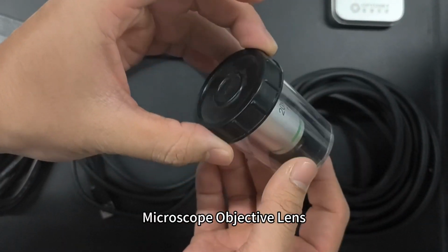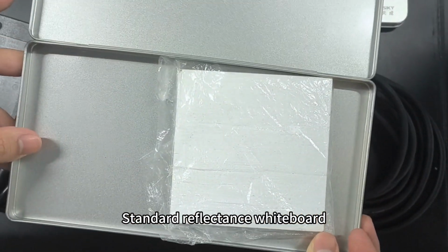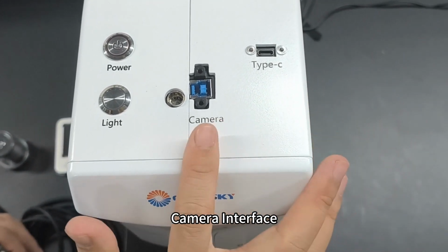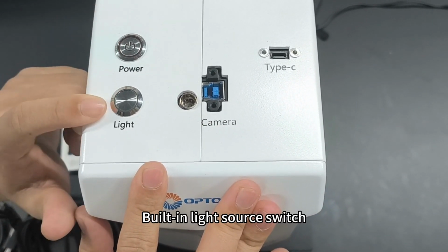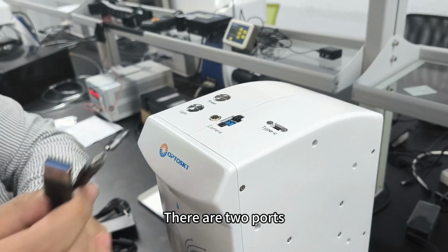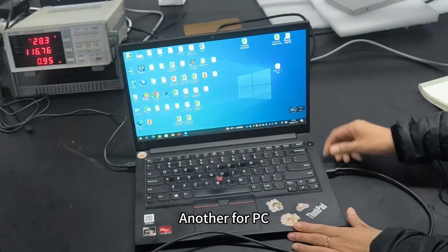Microscope objective lens, standard reflectance whiteboard, device connection port, camera interface, main power switch, built-in light source switch, power port on the back of the device. There are 2 ports. One for device, another for PC.